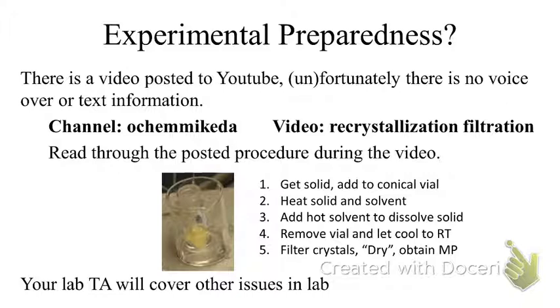Okay, I'm going to try table C first. Table C. What do you guys think? Why should we obtain a melting point? Identification. So we want to identify the compound. Sorry, I had to pick out tables because I couldn't hear everything. Too many answers. We want to be able to identify what compound it is. That's a good idea. How about table S? What's another option? Why else should we take a melting point?